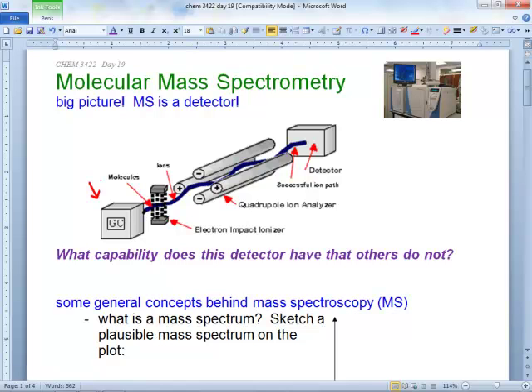However, regardless of the innards, the guts of a mass spec, whether it's ion trap or quadrupole like this one pictured, it has a capability that other detectors don't have. What is that? It's a pretty nice capability. Haul it into the jungle, find out why these people are getting their headaches cured. What I'm looking at is compounds. It can actually do a library search, right?